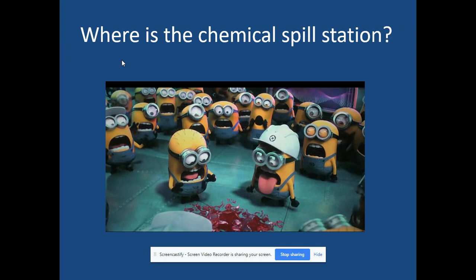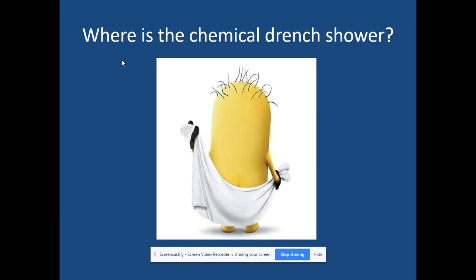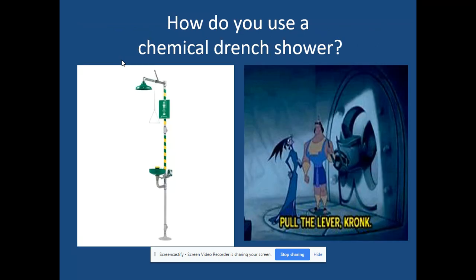If there is a chemical spill, there are certain ways we have to clean it up. And we want to make sure that we clean it up properly with the correct equipment. So please make sure that you let me know if there's a chemical spill. There is also a chemical shower at the front of the classroom. This is for if you ever get chemicals all over the front of you or have a big chemical spill. We want to make sure that we utilize that when it's appropriate. You use the chemical shower by pulling on the triangle as seen in the picture here, and that will let a massive amount of water come down on your head to ensure that we get rid of the chemicals.